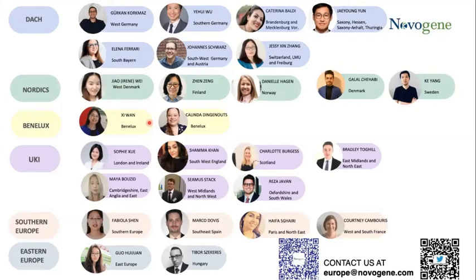Laura Bethel has asked, what is the longest read we can obtain from the Illumina platform? For the Illumina platform, the typical maximum read length we can get is 500 base pair. This will require us to use the NovaSeq SP flow cells with PE250. So for this one, we can sequence 250 base pair at both ends, and in total, it will give us 500 base pair.